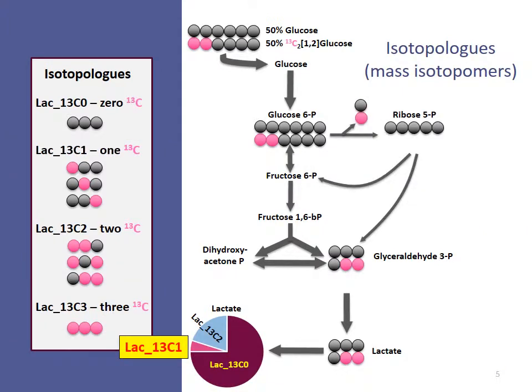However, the situation becomes more complex if an additional pathway is added, in the example the oxidative branch of pentose phosphate pathway, where one of the labeled carbons is lost, then resulting in the appearance of isotopologues with 1 labeled carbon. Interestingly, the abundance of isotopologues with 1 labeled carbon will depend on the relative fluxes through glycolysis and pentose phosphate pathways, then allowing indirectly for the estimation of these fluxes, by comparing model predicted and experimental isotopologue abundances.